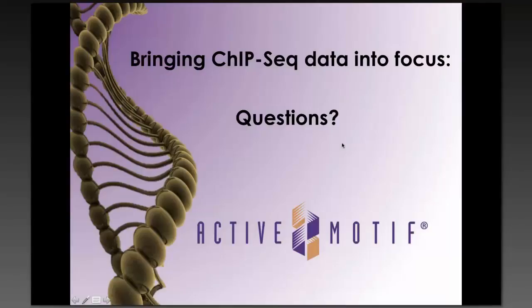How many reads do you think you lose to the Drosophila genome? And do you need to multiplex fewer samples for this technique? In the studies with K27, the numbers have been somewhere between 500,000 and 5 million. So let's look at the one Genentech sample. I think we had 1.5 million Drosophila reads in the DMSO treated samples and somewhere close to 6 million in the inhibitor treated samples. So, if you're sequencing somewhere between 30 and 50 million reads per sample, losing 5 million is not going to dramatically affect your data.